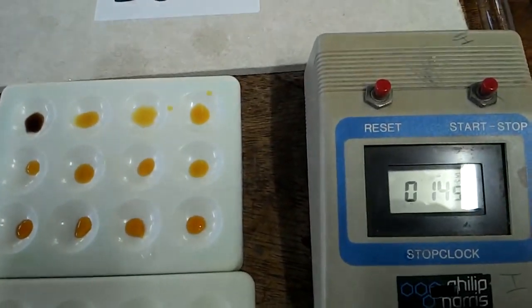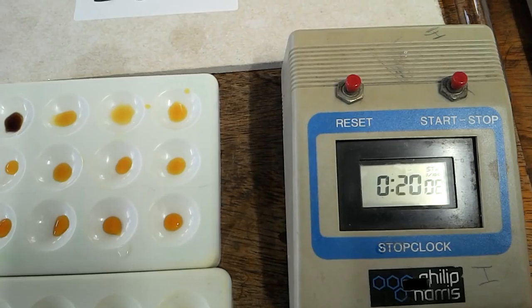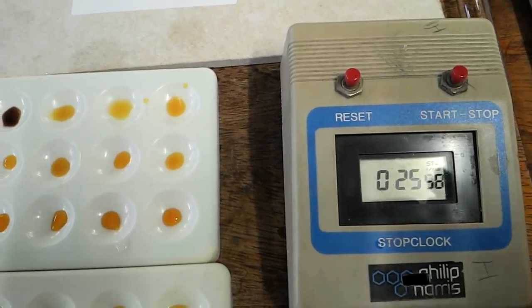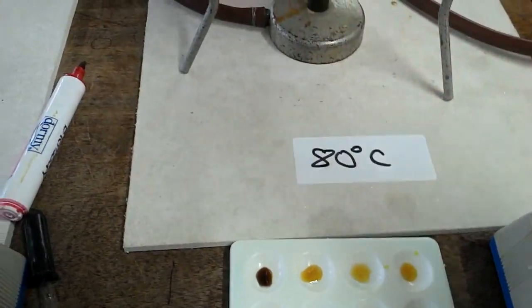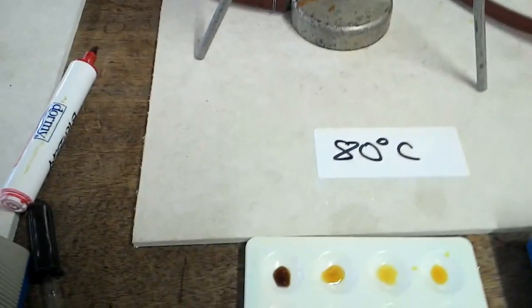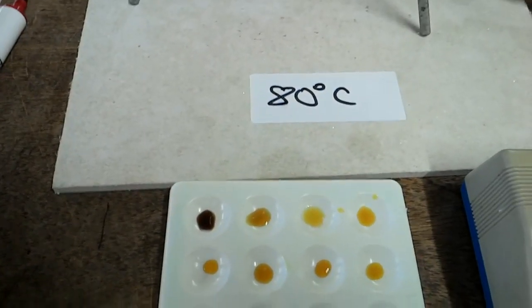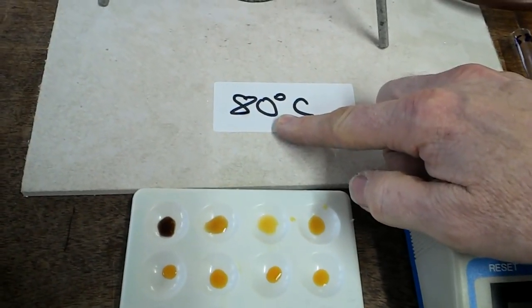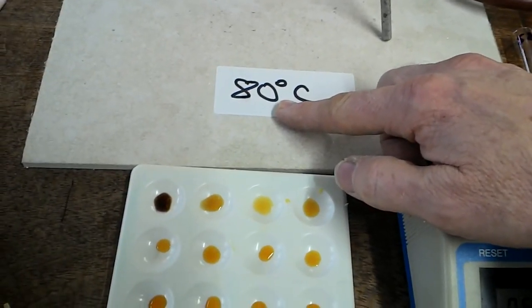Okay, and then in 15 seconds we need to take our next sample. Okay, 5 seconds to go. We can start getting ready. Take our sample, in it comes, and bang. Hardly any change. Okay, so in less than half a minute. Now this might not be what you expect. 80 degrees centigrade, textbooks might suggest to us that we would expect to see the enzyme being denatured. This enzyme is not denatured. Things are not necessarily as you expect.